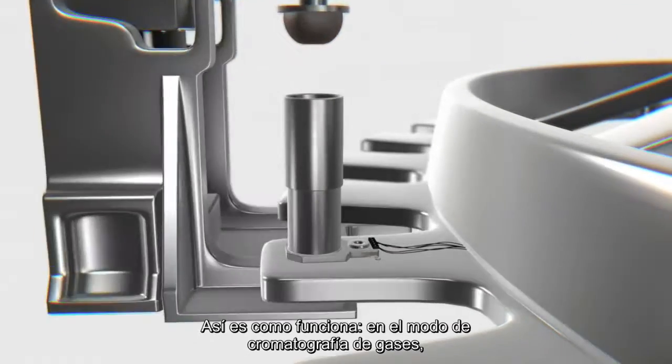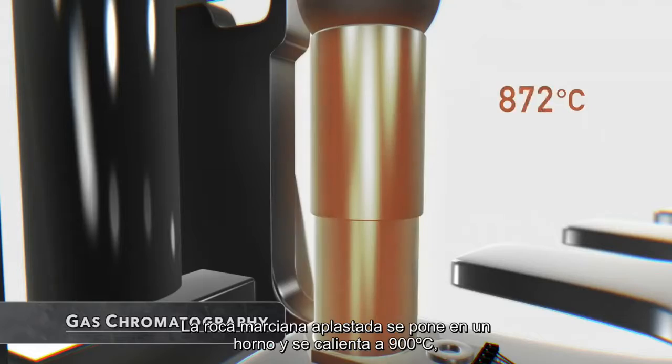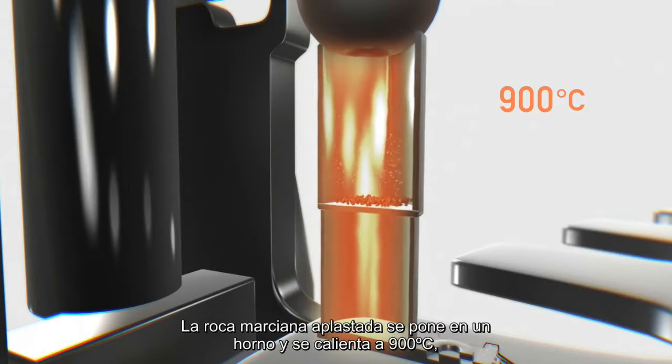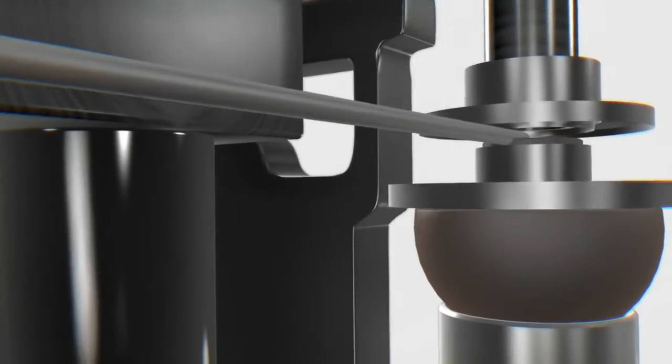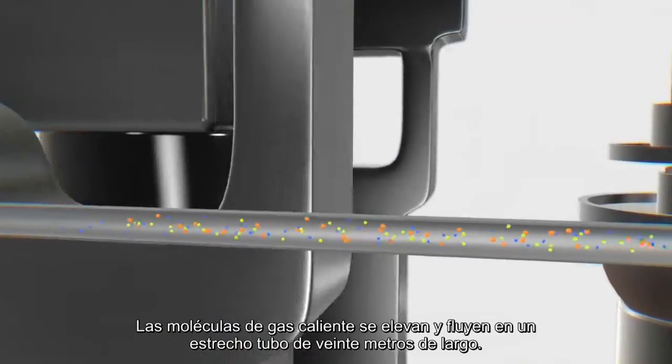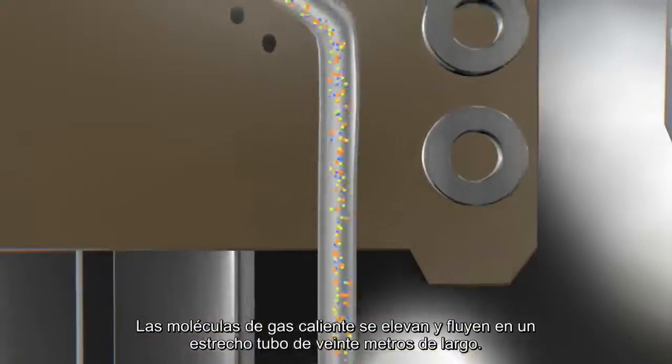Here's how it works. In gas chromatograph mode, crushed Martian rock is put into an oven and heated to 900 degrees Celsius in just 2 minutes, vaporizing the sample. Molecules of hot gas rise up and flow into a narrow 20-meter-long tube.